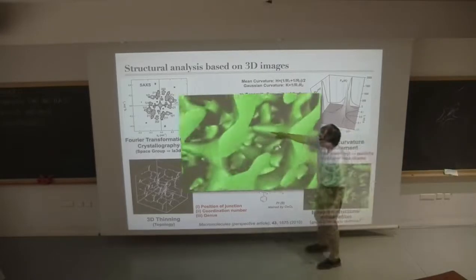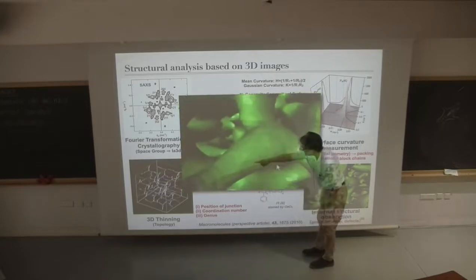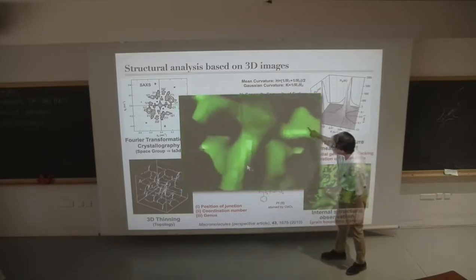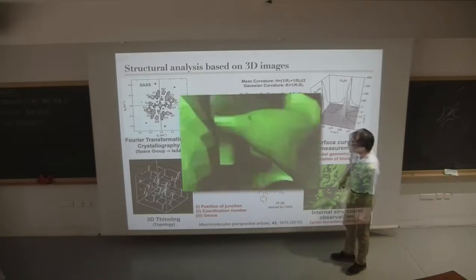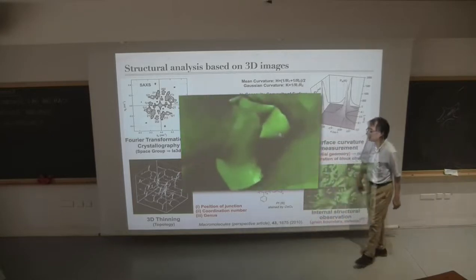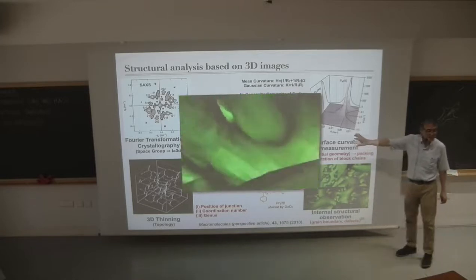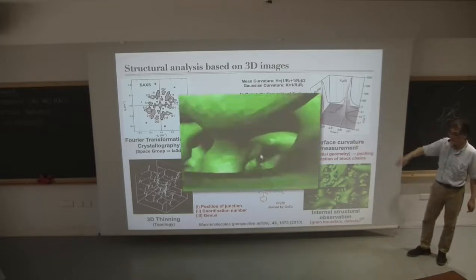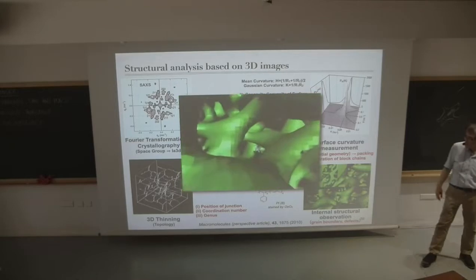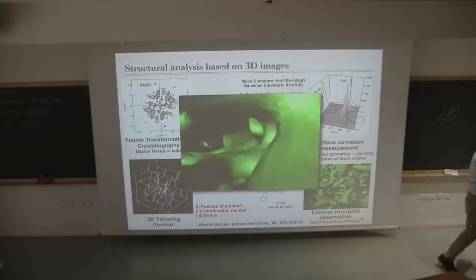For example, this domain is disconnected here, and then you have a 3-connector here, right? And then again, a 3-connector, and then you have a strange domain there. This is, I think, an irregularly connected part. So you can learn a lot of things. You can find defects. You can sometimes find proper 3-connectors. And again, this is not a computer-simulated image. This is actual data. All right.